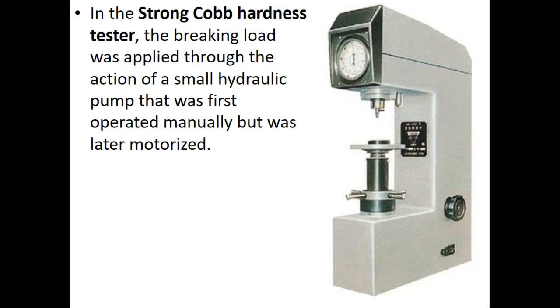In this device, the breaking load was applied through the action of a small hydraulic pump that was first operated manually but was later motorized.